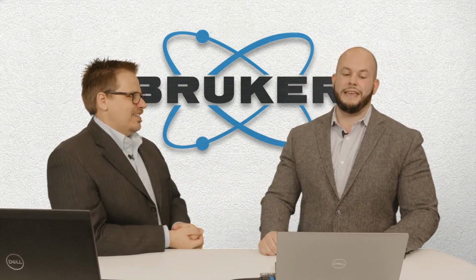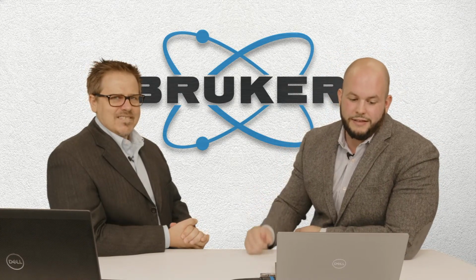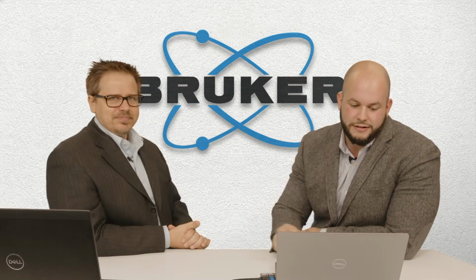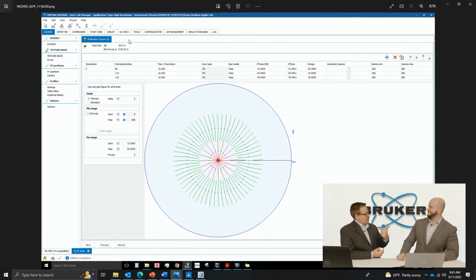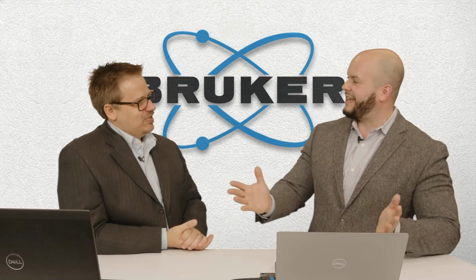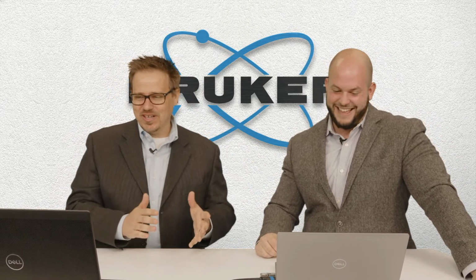Yeah, it's true. You guys can't see my screen anymore, but all three of these took, as you can see in Wizard, less than an hour. Under an hour to collect this, because we're taking full advantage of the Eiger. I remember taking one pole figure back in the day, when I was young and we had a point detector. To get one pole figure with the two background pole figures, it would take us a whole day, for just one. Exactly. That's the old-fashioned way. Now with these 2D detectors, you can collect a lot more data and it takes a lot less time. Everybody's happy. And you get free reflections too sometimes, right? Exactly, because they all fit in there.